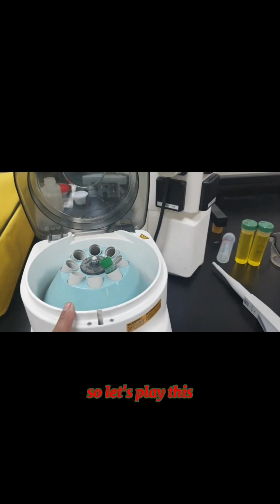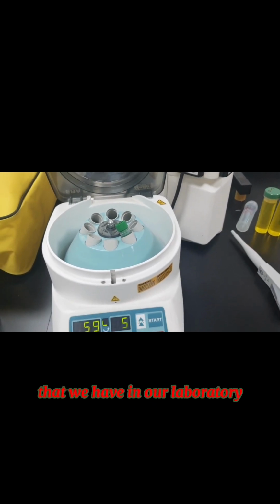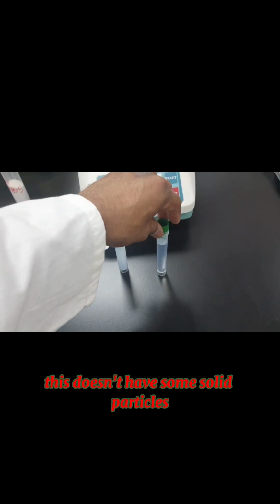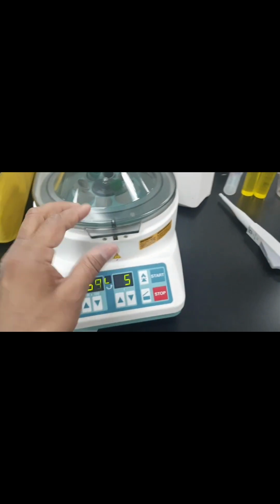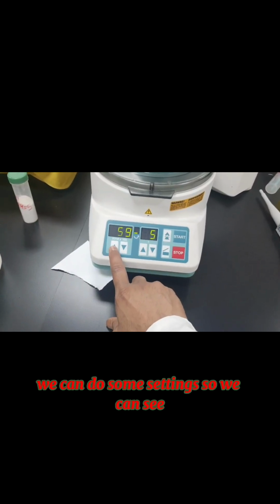So let's play this, and then we will subsequently see the other kinds of centrifuge that we have in our laboratory. Now you can see here I added the solution, which is having some solid particles, and this one doesn't have some solid particles. Now I will try to add here, and then I have to cover the lid, and then we can do some settings.